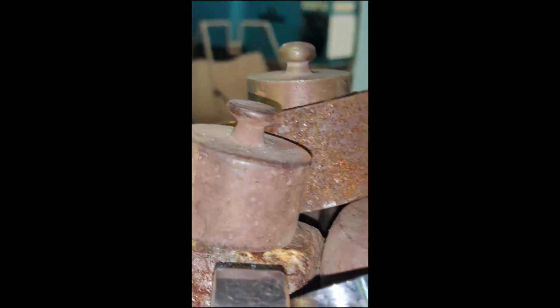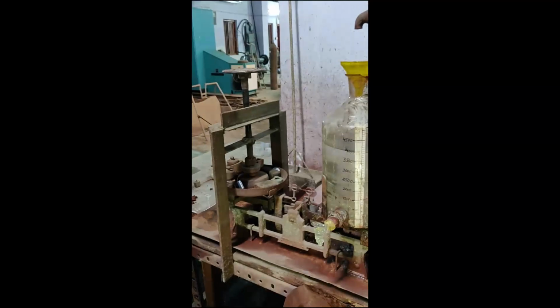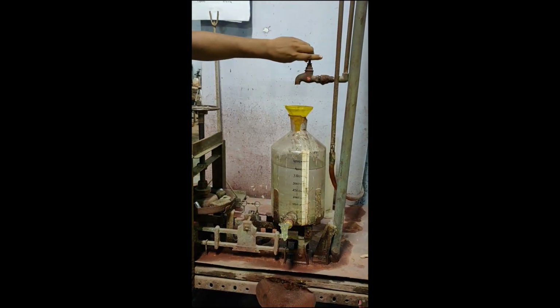So it is broken. 3950. The pellet is already in contact between these two plates, and we are filling the water. Then we'll observe for the breaking of the pellet.